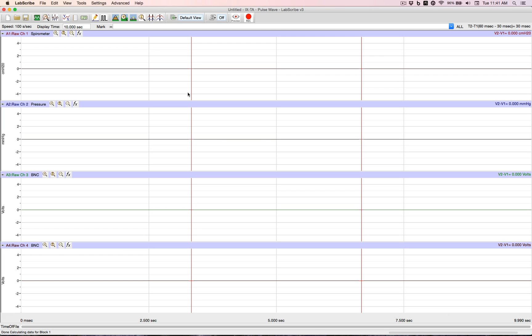In LabScribe, you have the ability to preset your labs ahead of time. What's a preset? Well, how many channels you want, how big are they, what colors are they, what are their names? That's a preset.